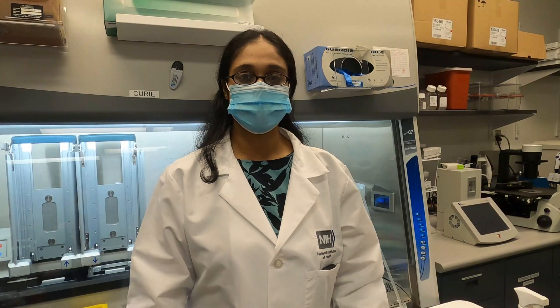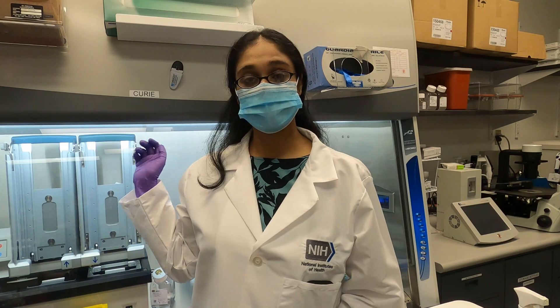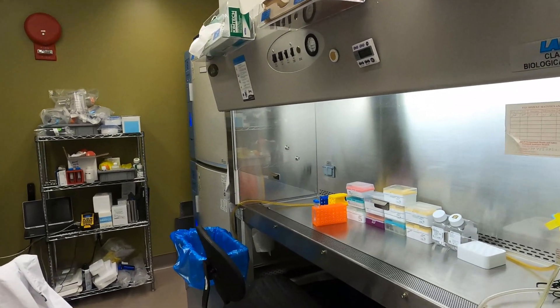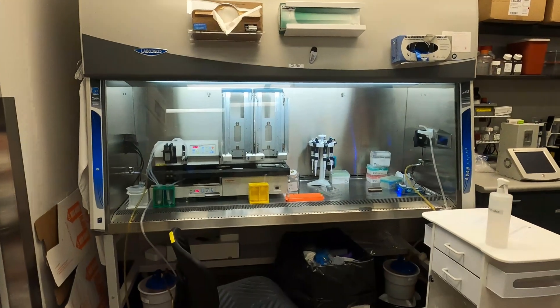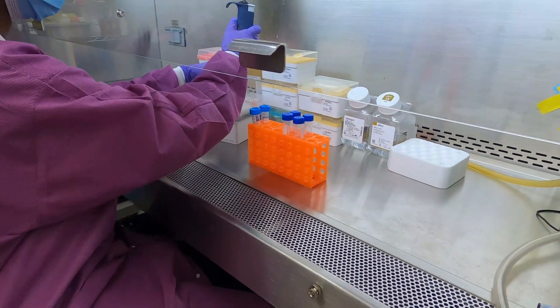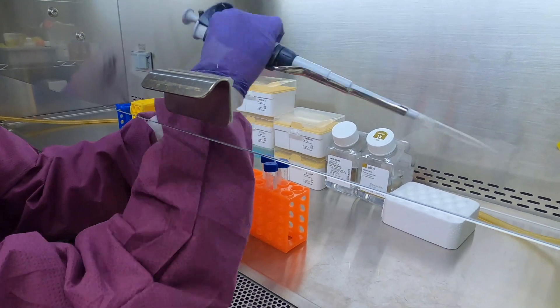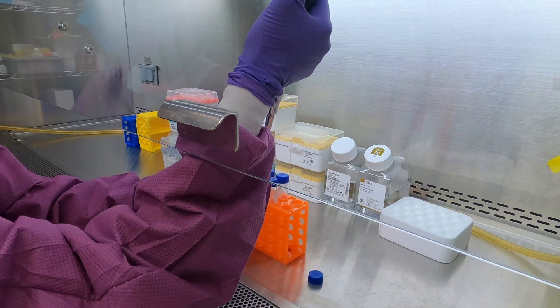This is our tissue culture room where we do cell culture. We have four tissue culture hoods and several different incubators to house all the different types of cell culturing we do in this room. It's a standard tissue culture BSL-2 lab, and we do everything from primary cells to mammalian, suspension and adherent cells — all the different types you can think of.